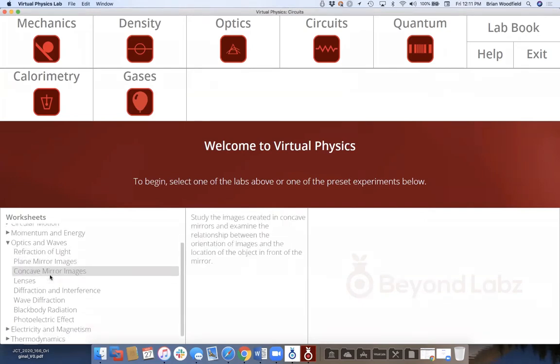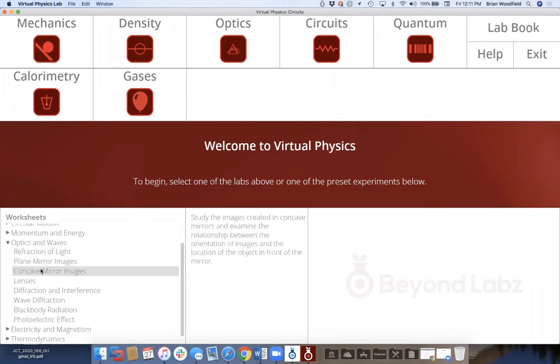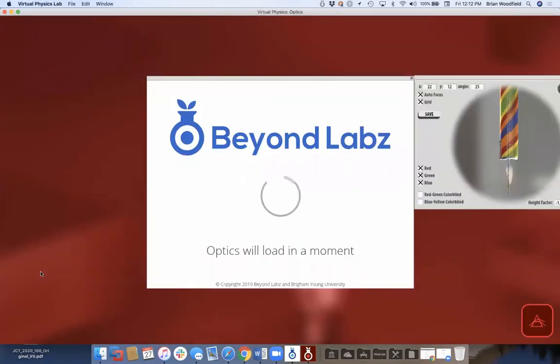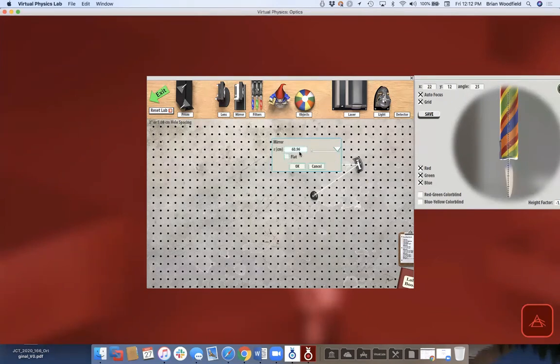Each lab activity has a preset, and these presets correspond to those lab activities with the same organization in the worksheets. So if you were doing a concave mirror experiment, you'd click on it and it brings you to the optics lab. You'd see a virtual eye, the angle it's at, the concave mirror, and you could click to change the radius of curvature or make it flat. The object is a candle and you'd see what the real image would be.